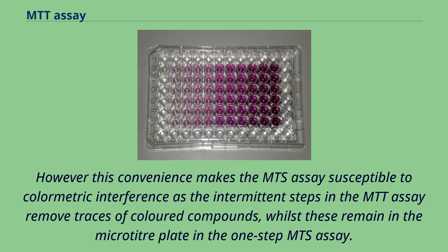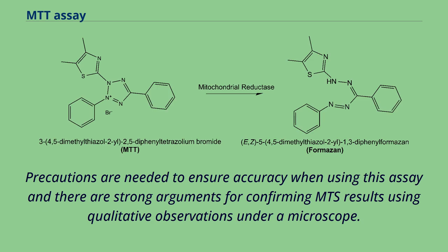However, this convenience makes the MTS assay susceptible to colorimetric interference, as the intermittent steps in the MTT assay remove traces of colored compounds, whilst these remain in the microtiter plate in the one-step MTS assay. Precautions are needed to ensure accuracy when using this assay, and there are strong arguments for confirming MTS results using qualitative observations under a microscope.